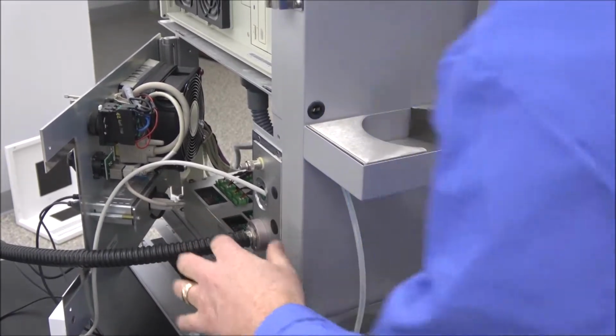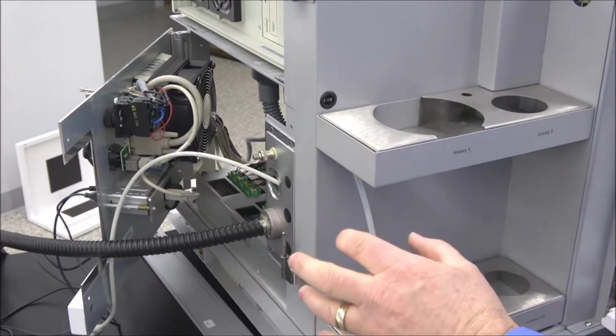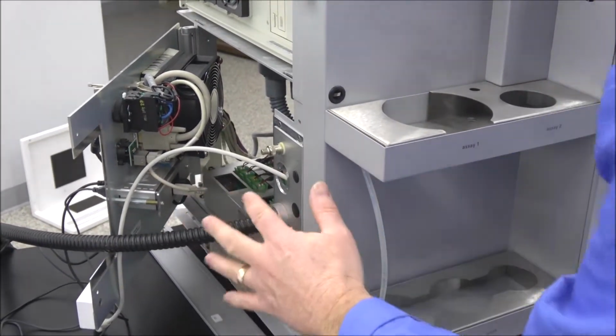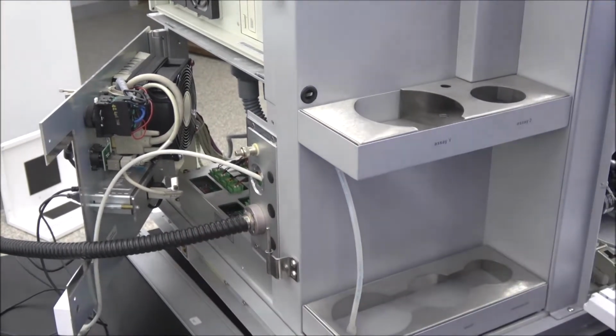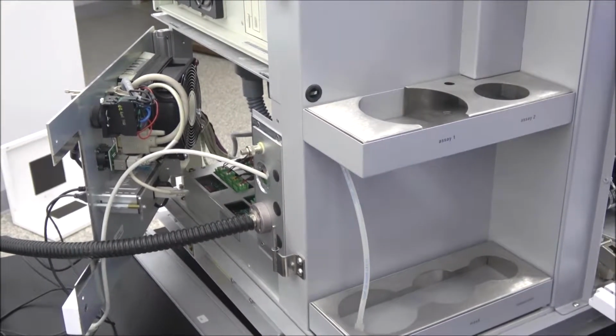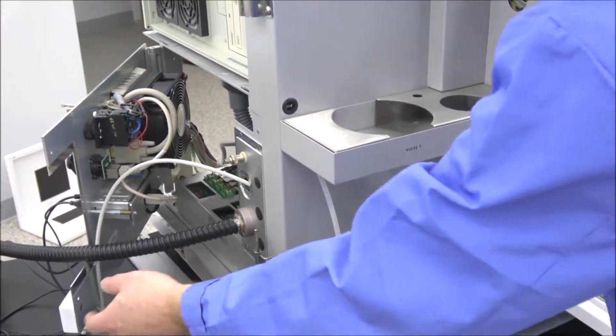Now I can't remember exactly, your conduit perhaps already has a nice fitting. It almost seems like your conduit screws on a little nicer than this one, so you'll just have to look at it again. This one here is, I believe, a little bit different. But now we've got the conduit hooked in.